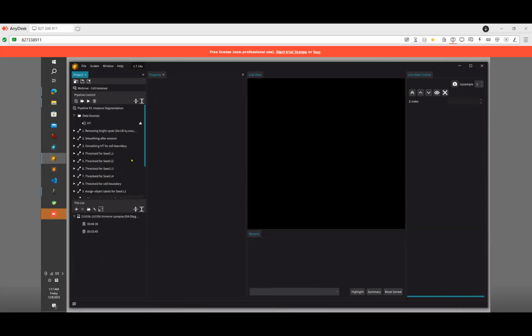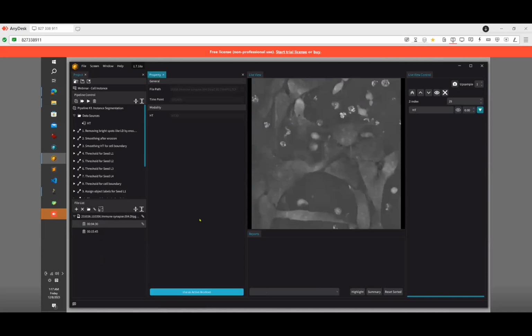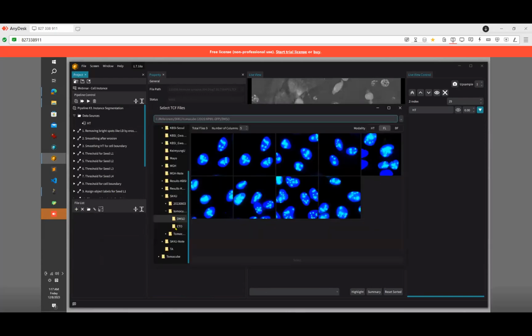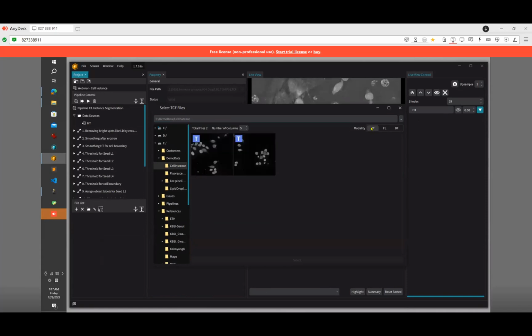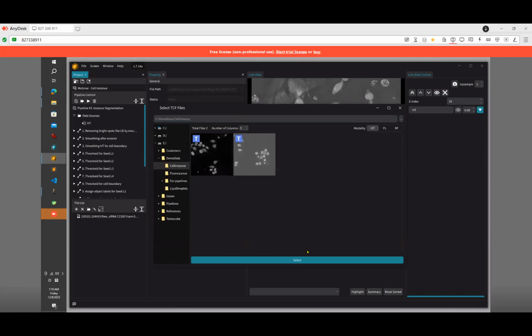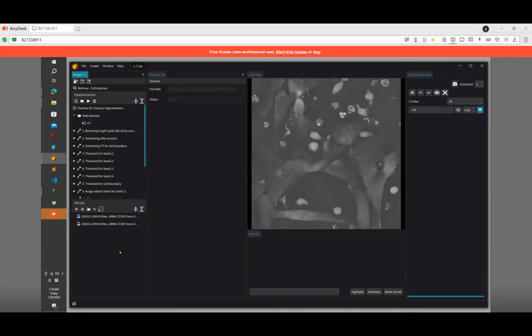And the last part is about cell segmentation. Load the data. Oh, it's not the data that I want. Okay. Cell instance. Yes, this one. Add more, like this. So here I want to show how the data is selected.